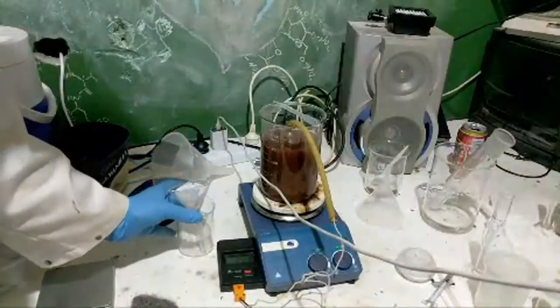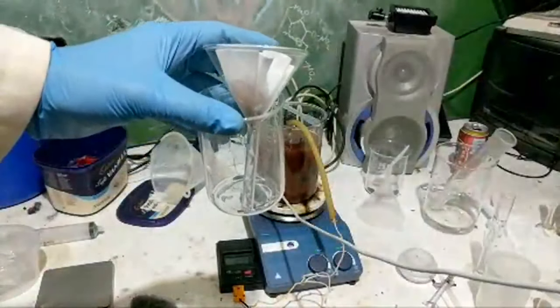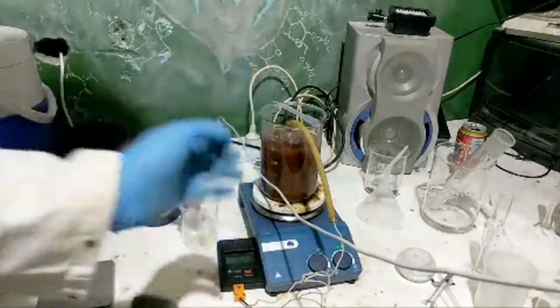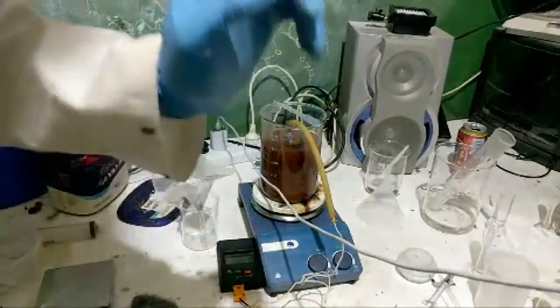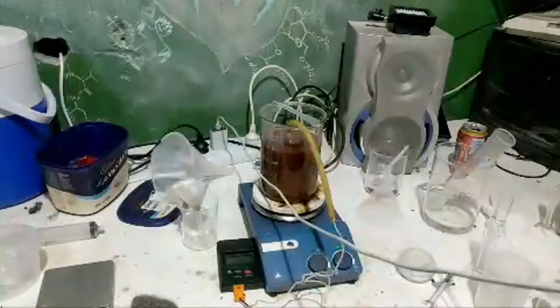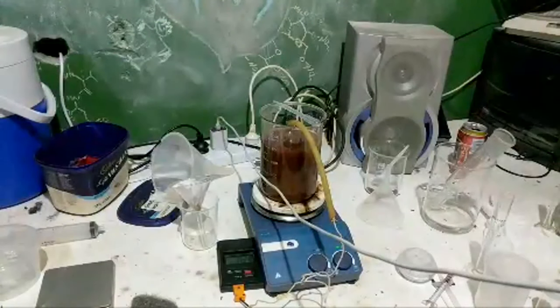Alright, doesn't look like there's any colour in that bleach, by the way. So things aren't looking great. What has this stream turned into? I feel like it's more coherent now than it has been before. So that means we're relying on this other method to have any success at all. So what do we need? We need a steel container. I will find a steel container. Need the torch. That looks good.